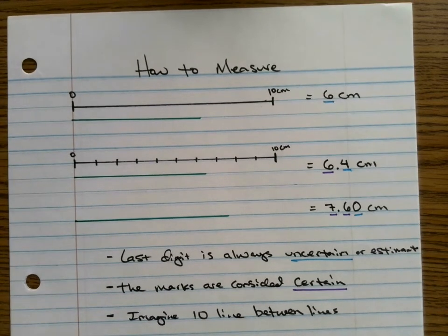Okay, it could be a graduated cylinder. And I'll have an example. I have a graduated cylinder that has tons of lines versus a beaker which has a line every 100, 200, 300 milliliters. The graduated cylinder is going to be much more useful to getting a better measurement. So if we have a choice in the lab to use different instruments, we will choose the one that's the most accurate for what we're working with.